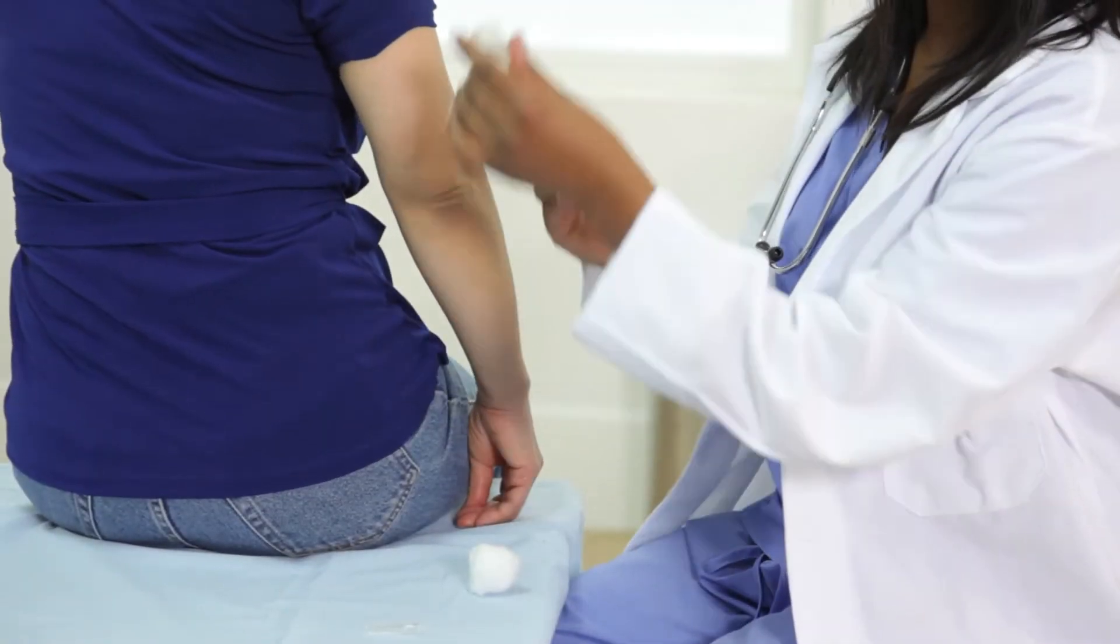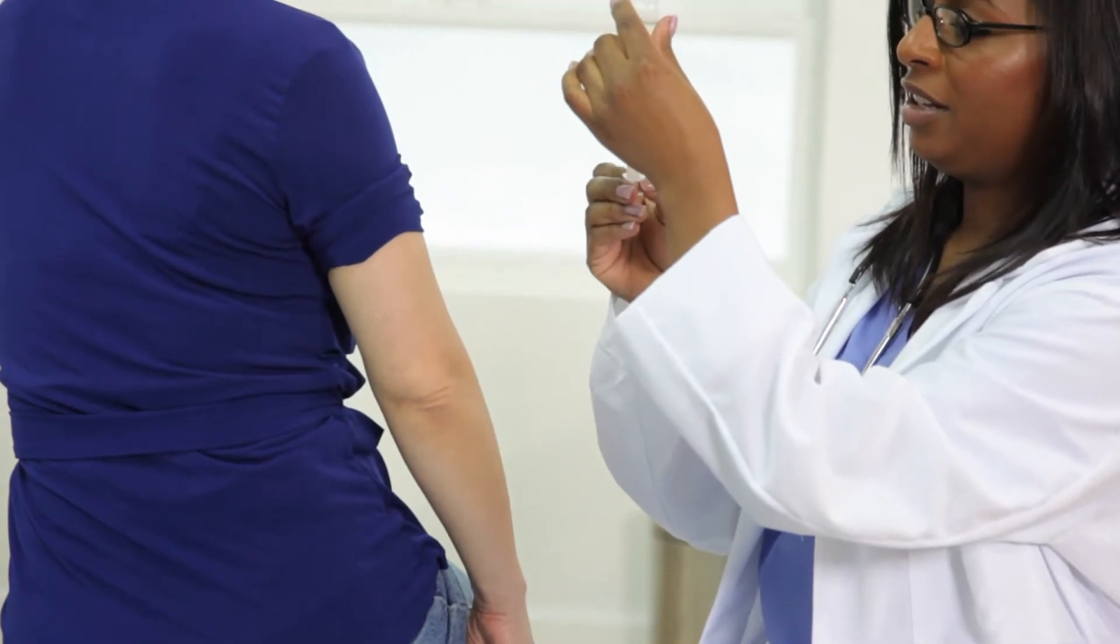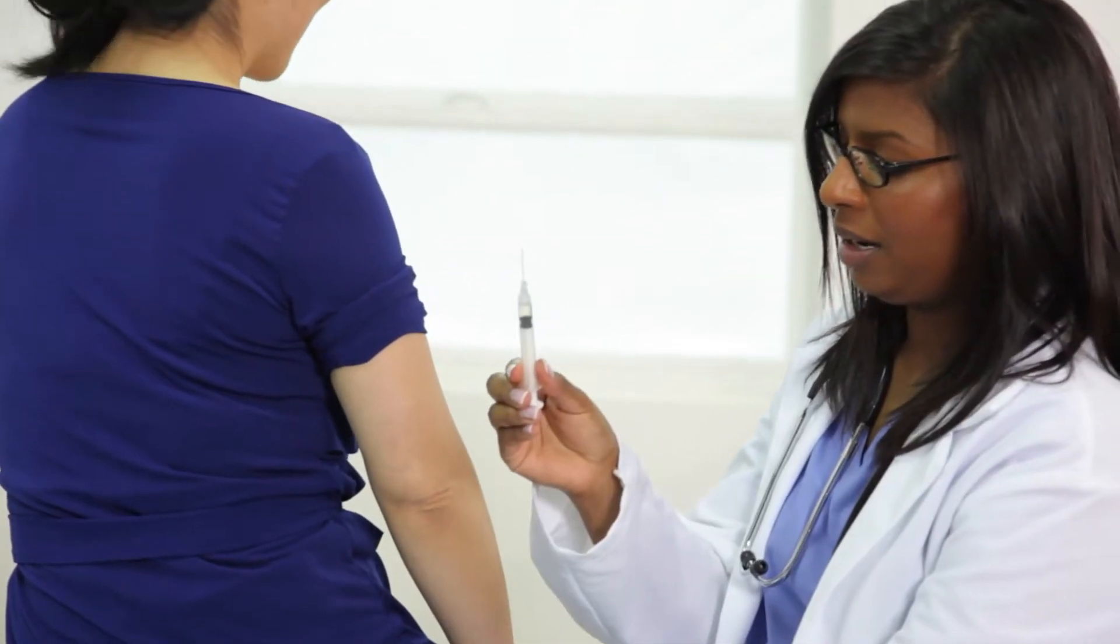The Sterisad NF family meets and exceeds the highest requirements in quality control, offering a convenient solution for secure sterility testing.